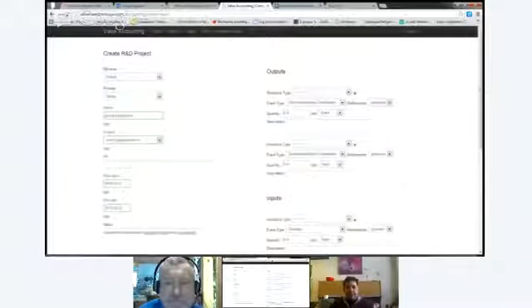This is actually a new way of making them, so it would be a new manufacturing process, right? Can be manufacturing process, design process, anything, you know. Anything you want to do. Okay. So here I created joint type 2.